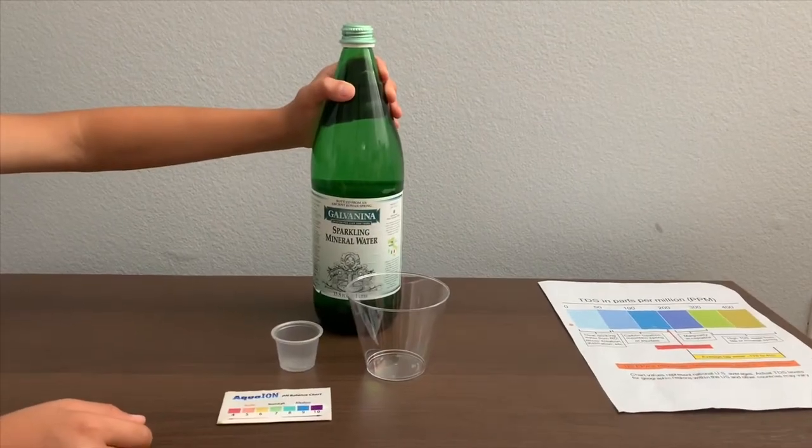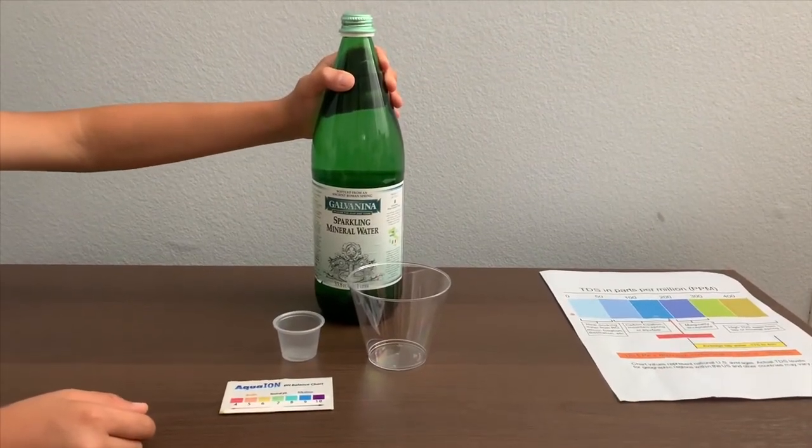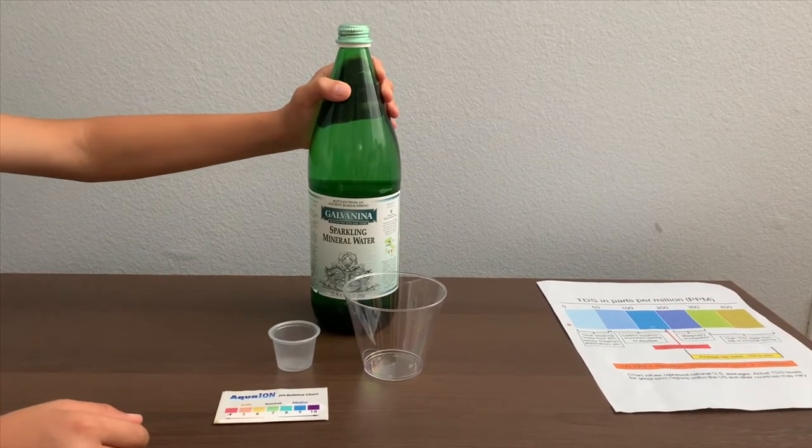This is Galva Nina Sparkling Mineral Water, it's sourced from Italy. Let's test the pH and TDS levels.